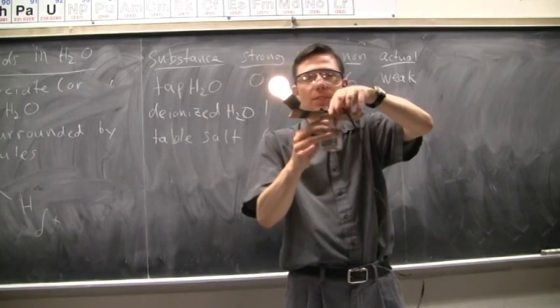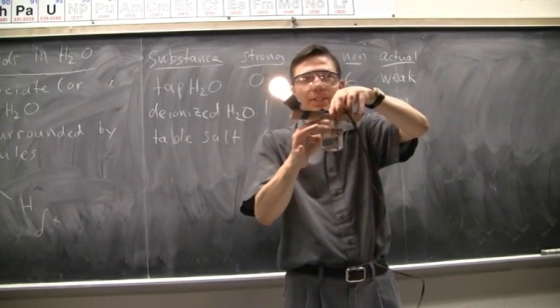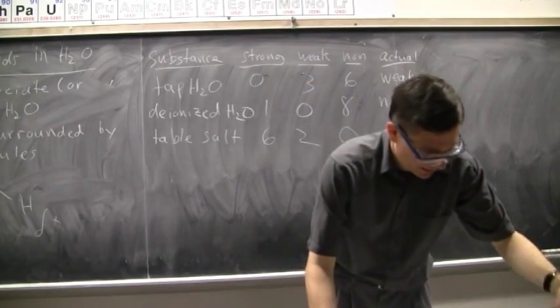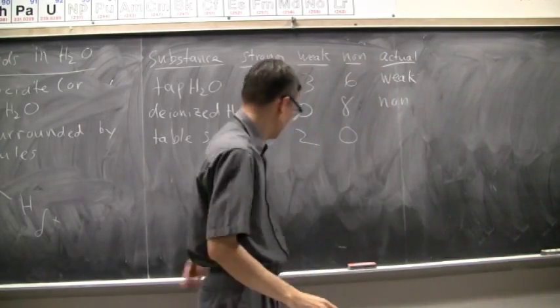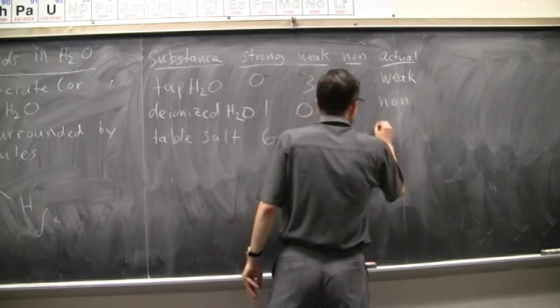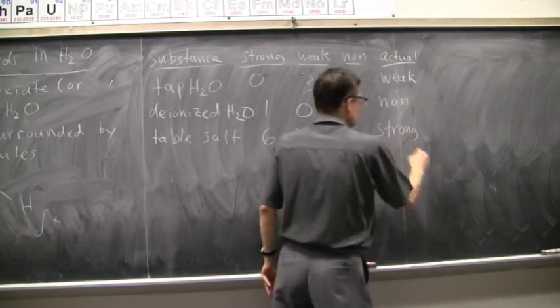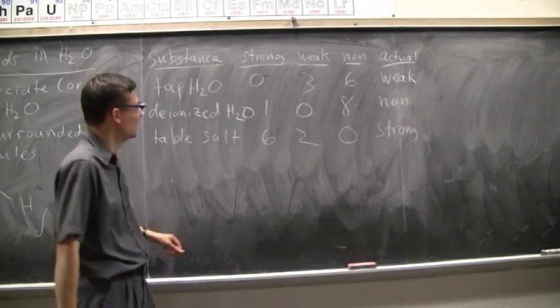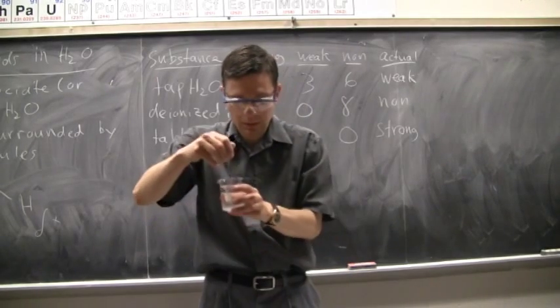All right. Let's see. Let's see what we got. There we go. Nice and bright. Strong. Strong electrolyte. I guess it would be the Arnold Schwarzenegger electrolyte. I don't know. Something.